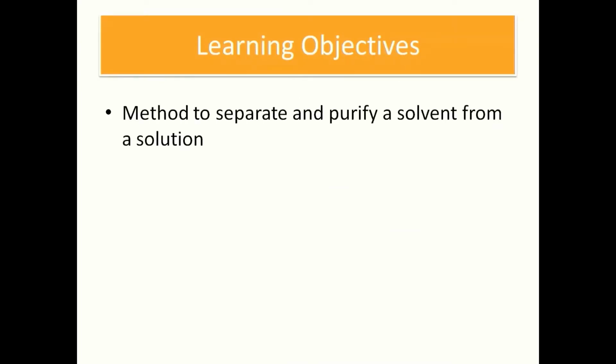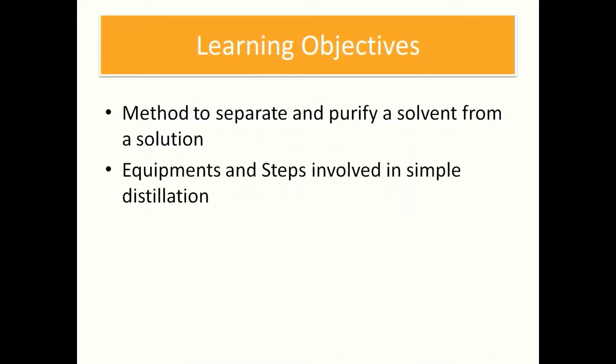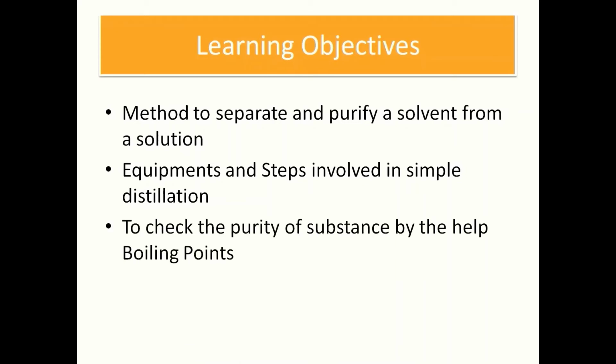Students will be able to learn about the method to separate and purify a solvent from a solution, the equipment and steps involved in simple distillation, and also learn how to check the purity of a substance with the help of boiling points.